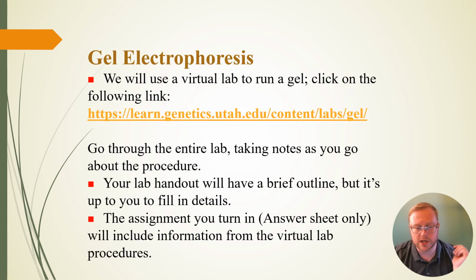So the gel electrophoresis. We can use a virtual lab to run a gel, and you click on the following link. I'm going to make this one optional. If you would like to click on it, great. There's a lot of good stuff on there to learn. You'll learn how gel electrophoresis works. That said, we're already trying to do 2 things in lab today, so I'm going to make this one optional for you. If you do it, great. Please let me know.